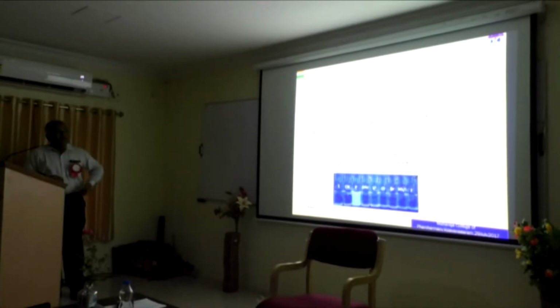So what we did, as an organic synthetic chemist, he makes all new compounds. Like that we prepared a new chemical. And then we took this and started adding chloride, bromide, iodide, all these kinds of things. It did not respond. Whereas the moment you add a fluoride ion, that is sodium fluoride, you can see that a new absorption peak is coming up. You can see that. Okay?